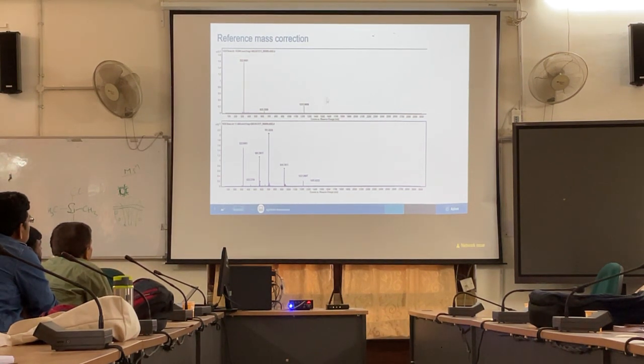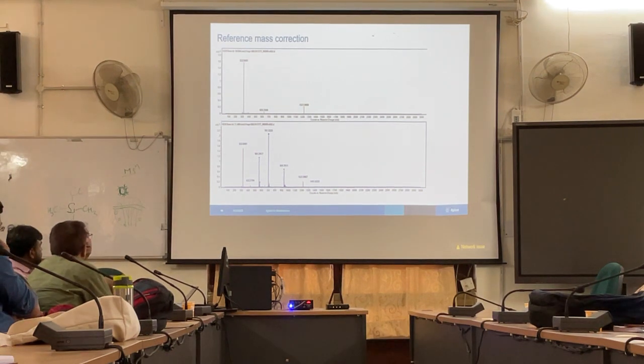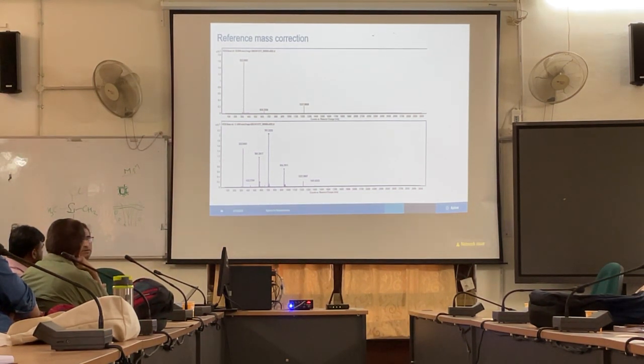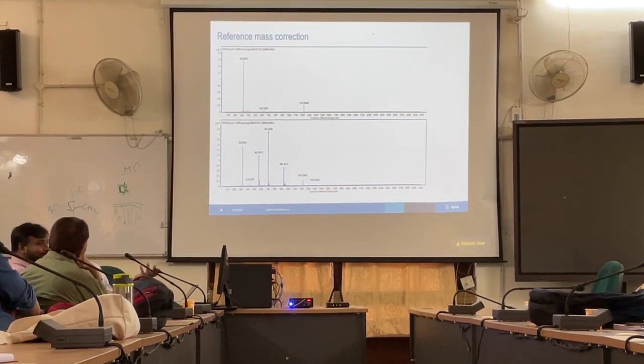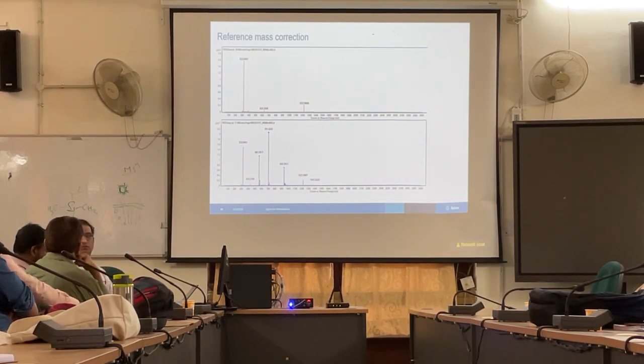So you see here, these reference masses, especially for metabolomics because you are running such long batches. You cannot stop the batch and do calibration. So if you are running 40 runs, this is also important: your runs cannot be very long, because if you run the instrument for 3 days, anything can happen, especially in places like FRI. Power can go, power can fluctuate, something can happen. So we are very mindful. We ourselves don't run the instrument unattended for more than maybe 12 hours.